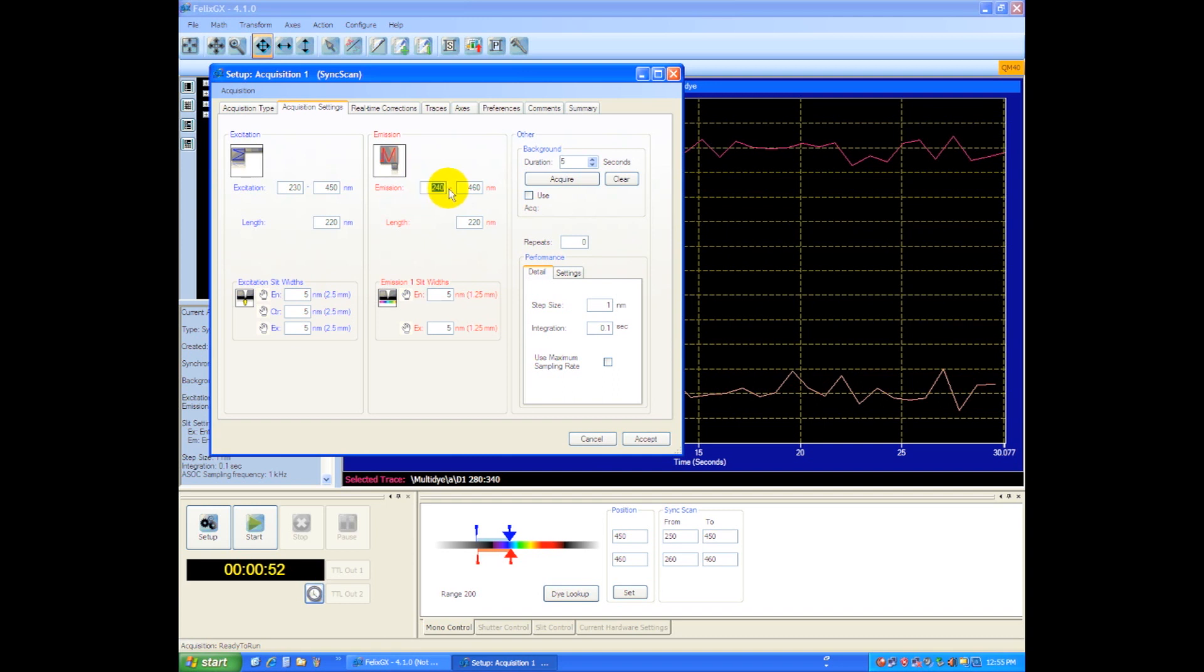Let's go say 250 and we'll scan to 470. That gives us the total length of 220 nanometers for each scan.